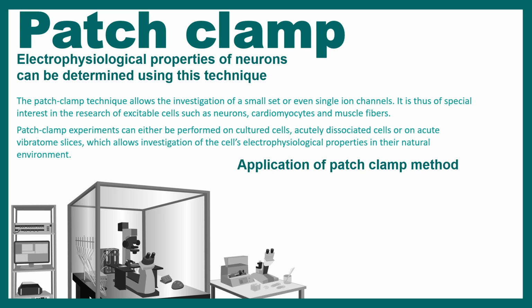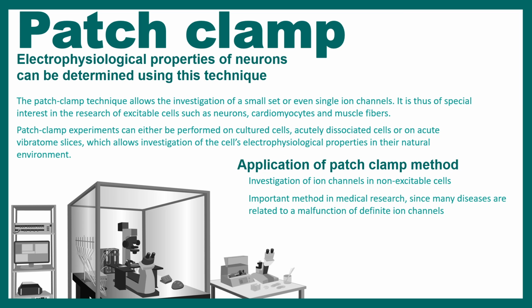So let's quickly look at the applications before we go into details. So first of all, we can investigate ion channels of excitable and non-excitable cells using the patch clamp method. This is a very important method for medical research because many diseases are associated with the malformation or malfunctioning of the ion channels. So in order to understand the ionic properties, this particular technique could be useful.